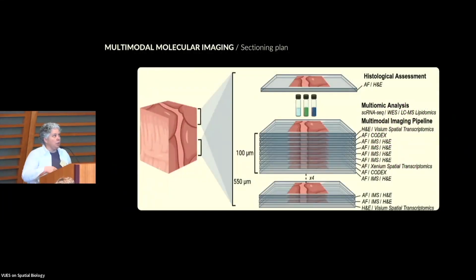And we'll see that autofluorescence microscopy is essentially the common language of a data set, in that you can collect it on every single tissue section in a stack. And then you can use that to co-register as you go from section to section. So that's the first key piece of this autofluorescence microscopy: it allows us to do serial section co-registration. It also allows us to co-register modalities that are collected on a single slide.